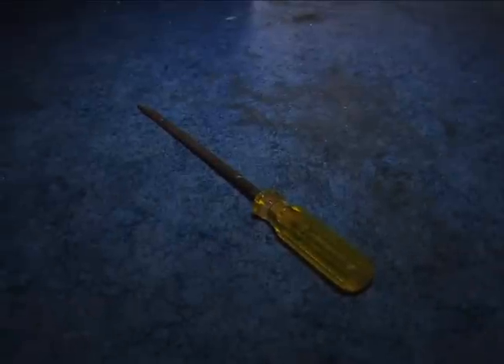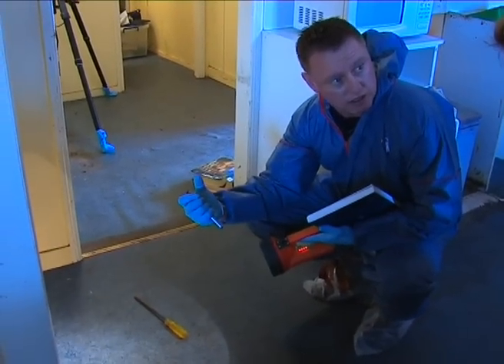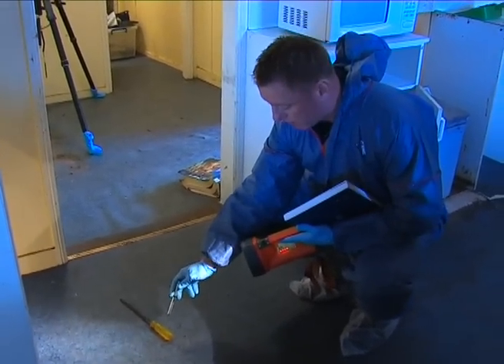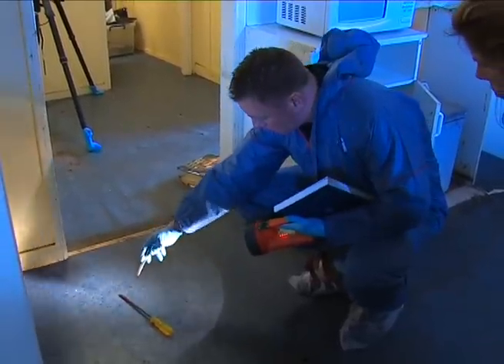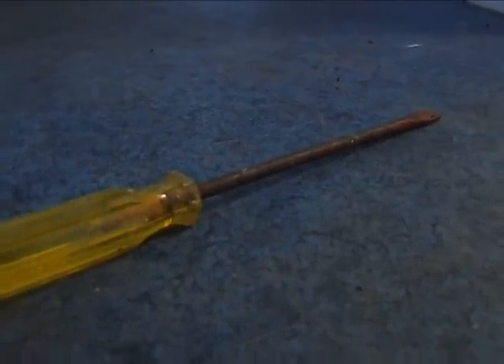With the screwdriver, what we're looking for is trace, which is cellular material from the person who's held it, so from the handle. We're hoping that we can get the offender's DNA on the handle, and you would think the complainant's blood on the screwdriver, which makes it consistent with the injuries that we've got.